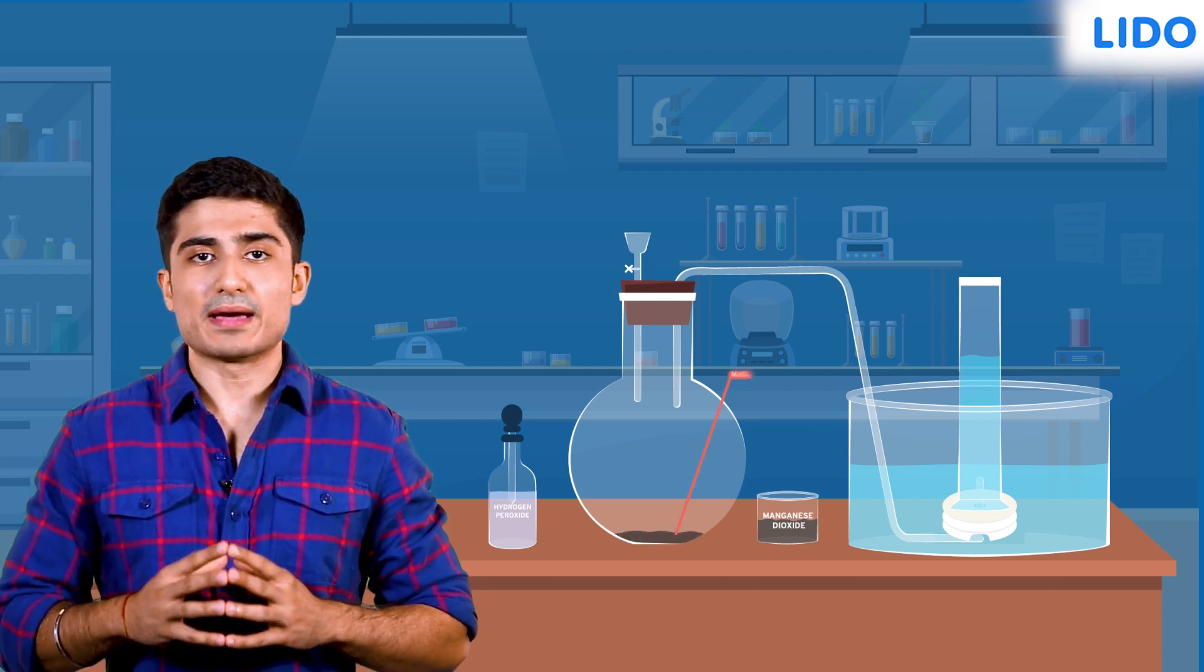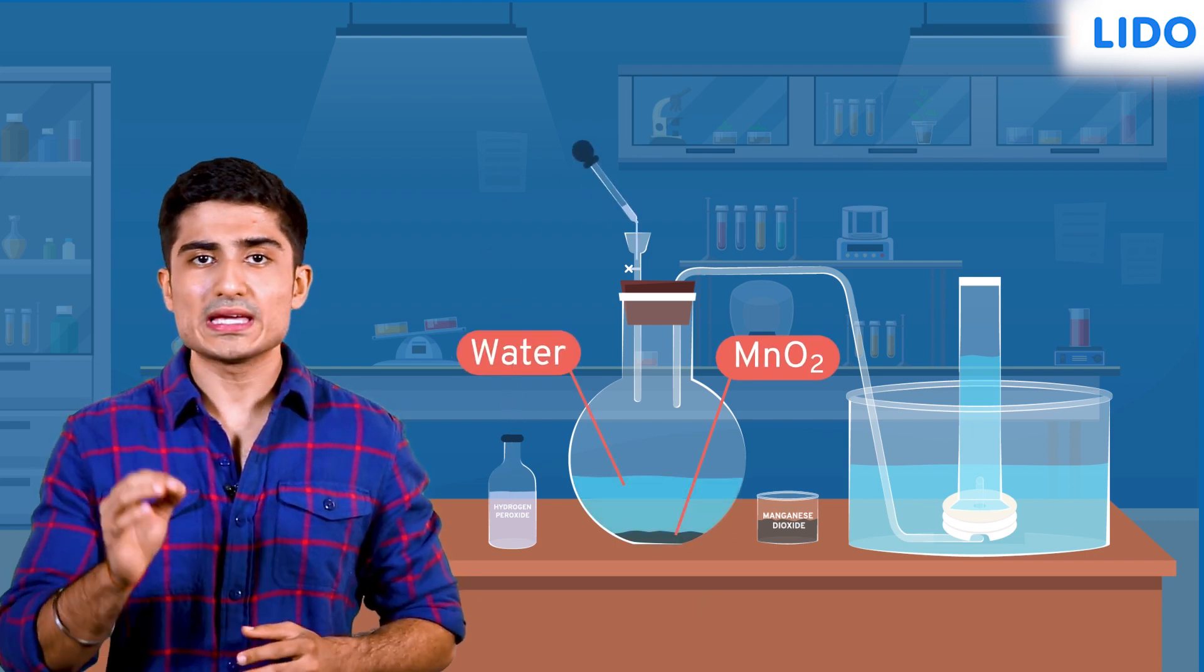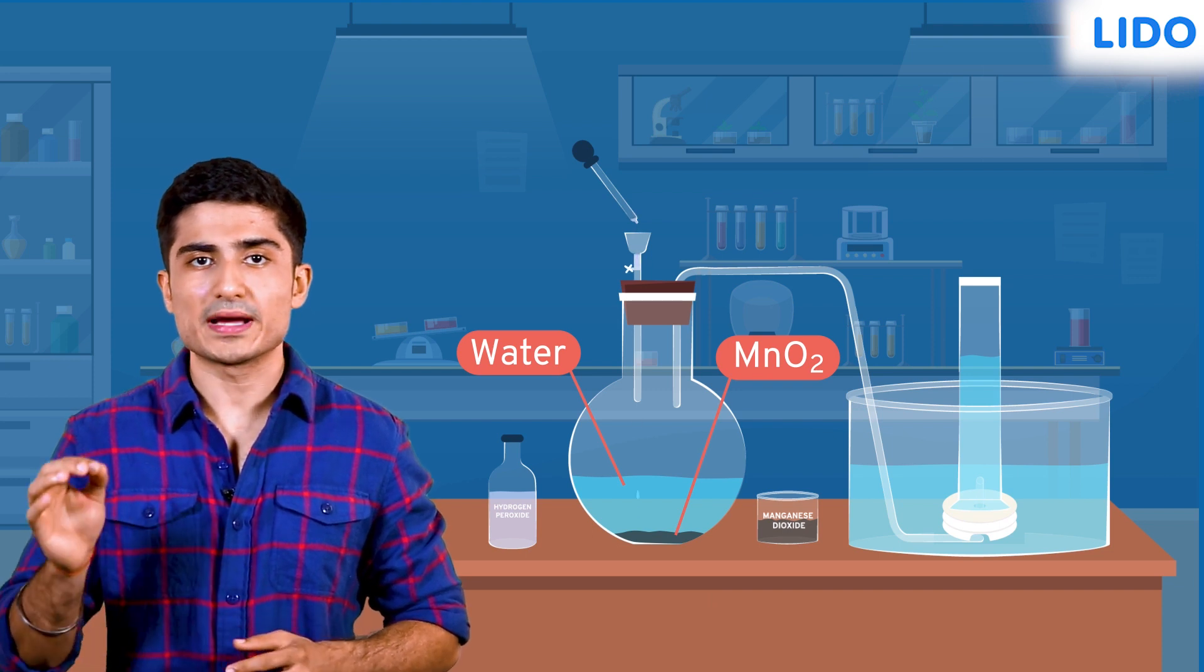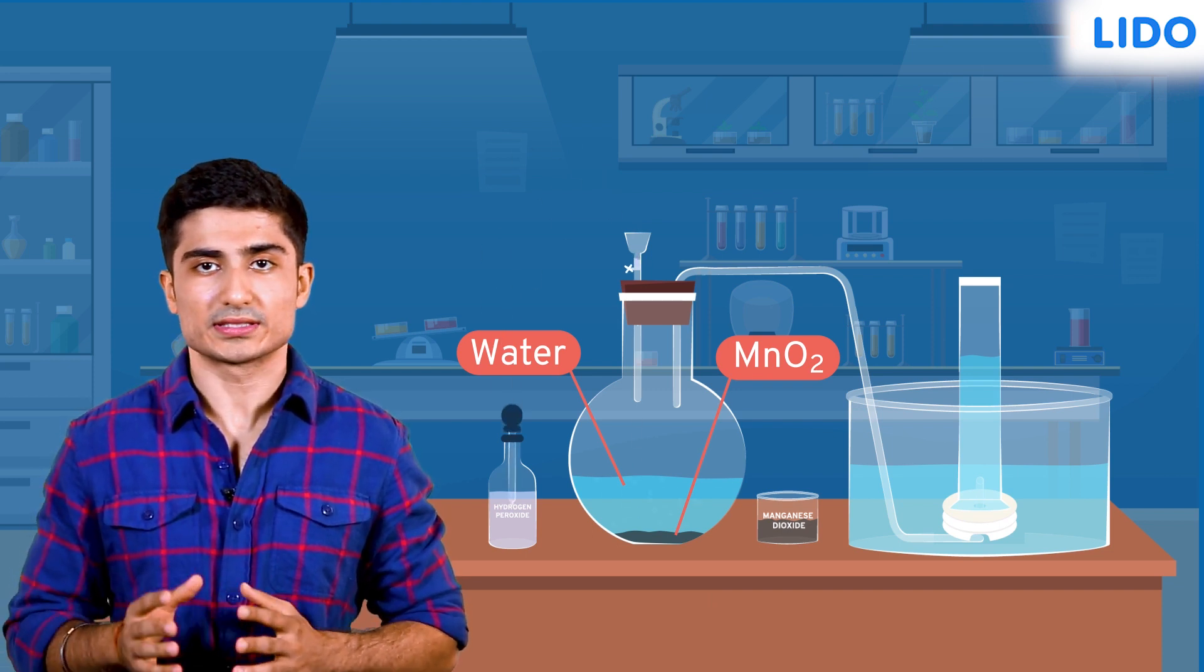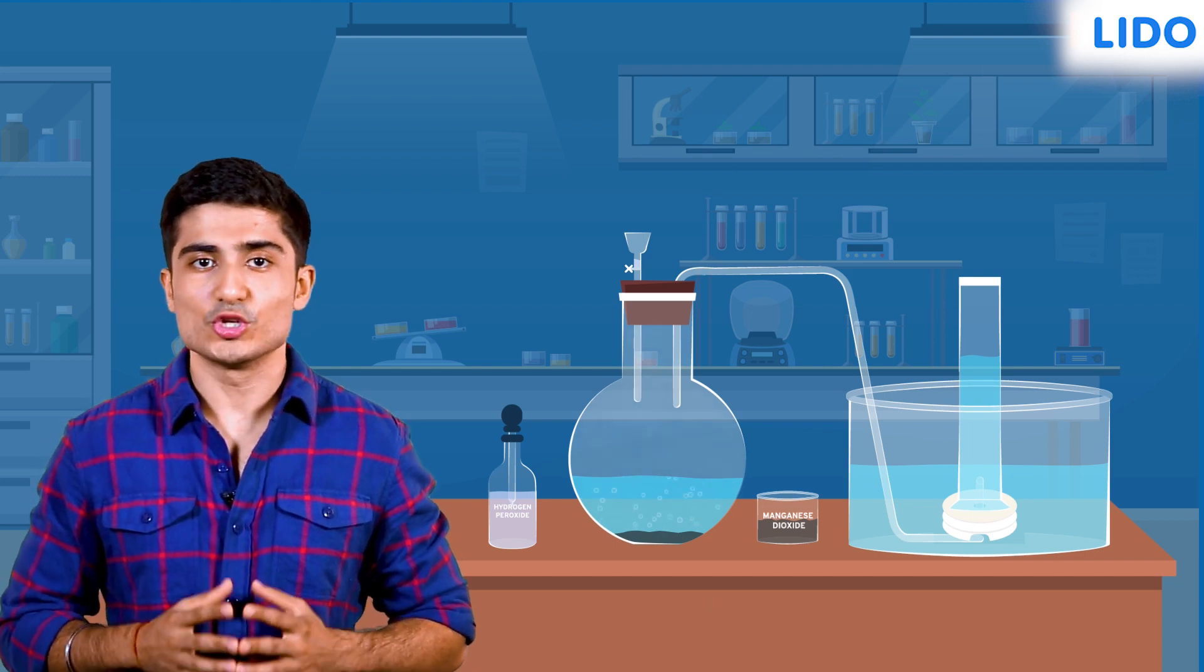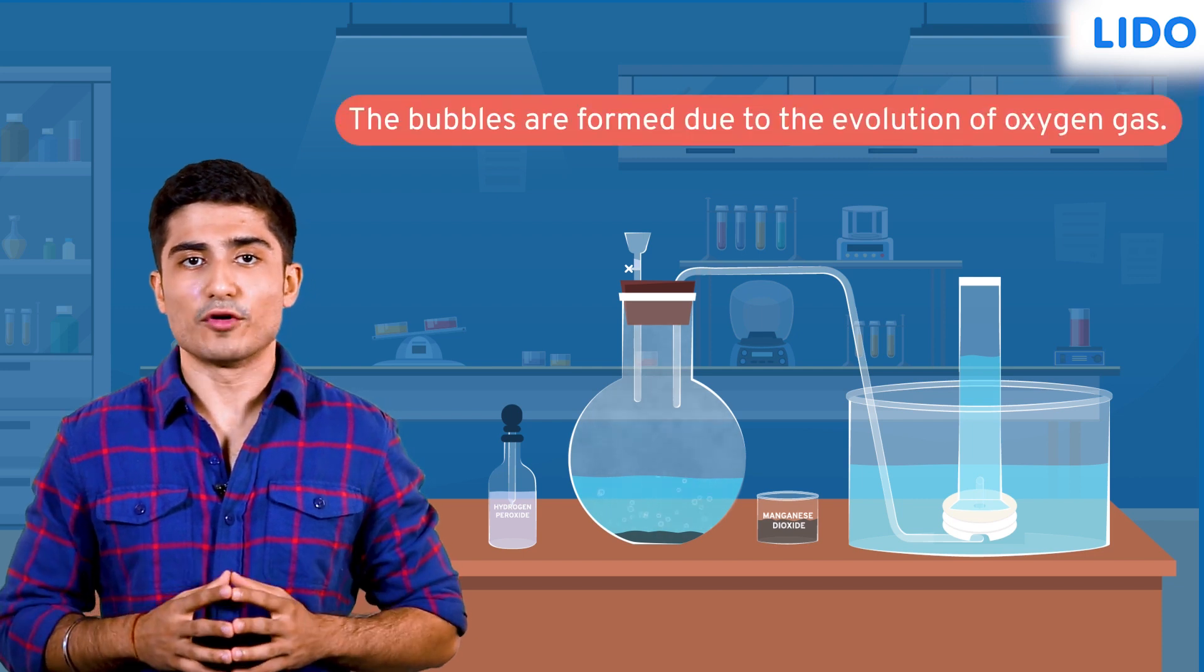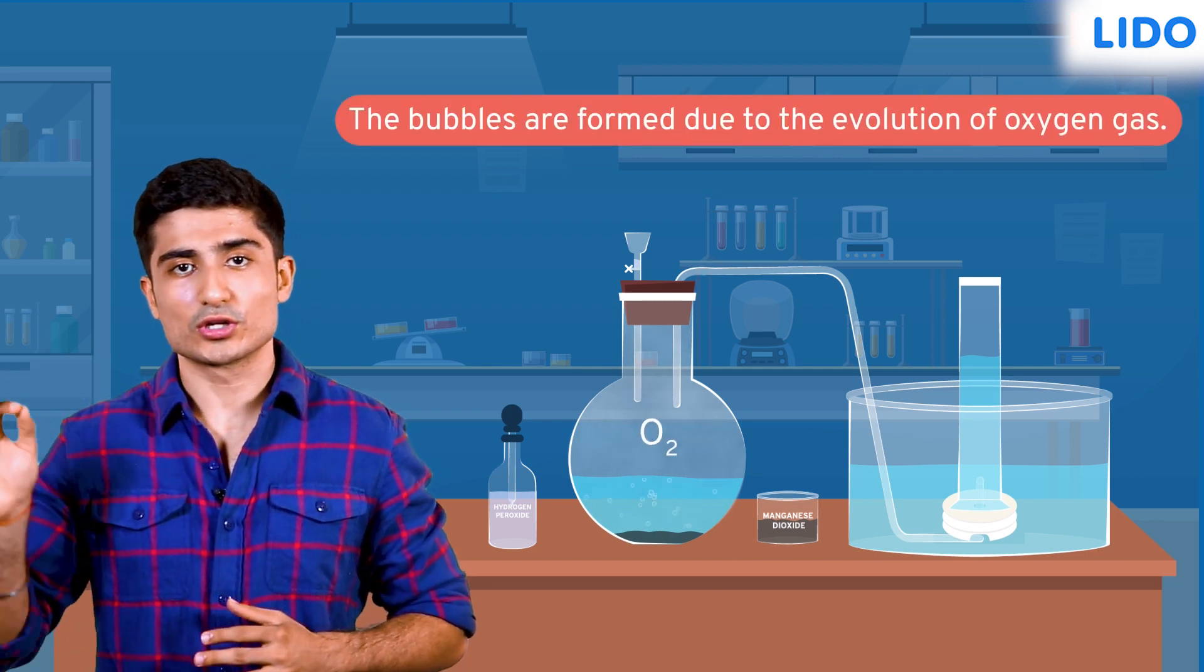We will take some manganese dioxide and water in a flat round bottom flask. We will now slowly add hydrogen peroxide drop by drop into the flask through the thistle funnel. As the hydrogen peroxide is being added, you can see that there are bubbles forming in the water. The bubbles are formed due to the evolution of oxygen gas.